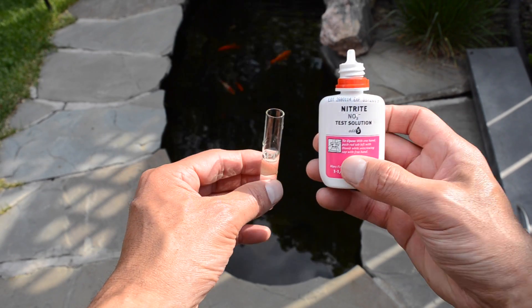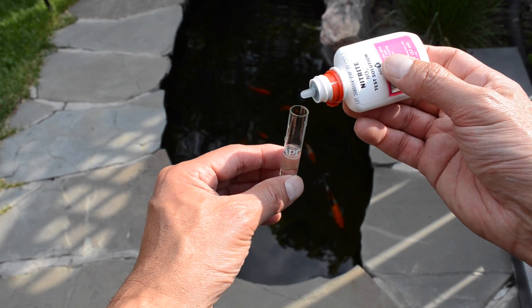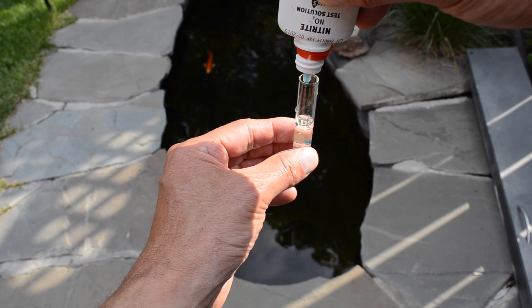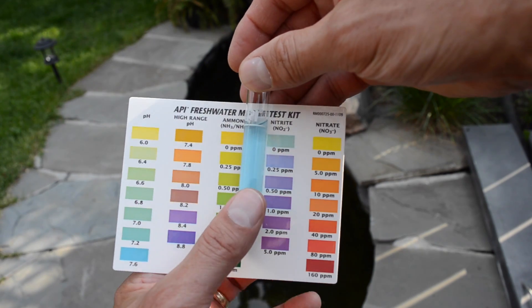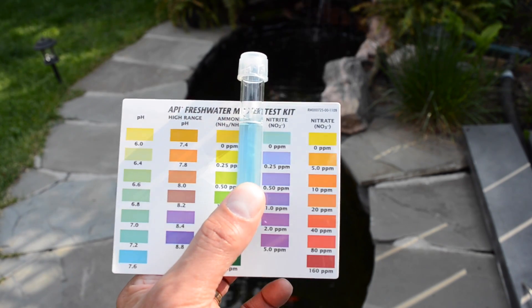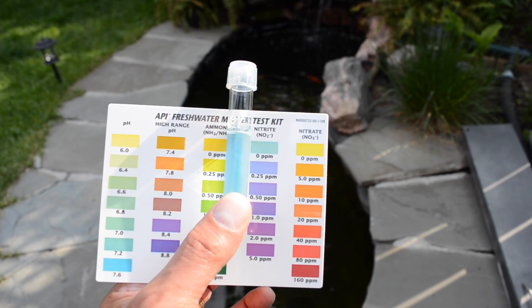All right, here's a check on the nitrite level. As you can see, by what I can tell I would give that a very good reading — it looks like zero parts per million. So I think we're okay on the nitrite level.